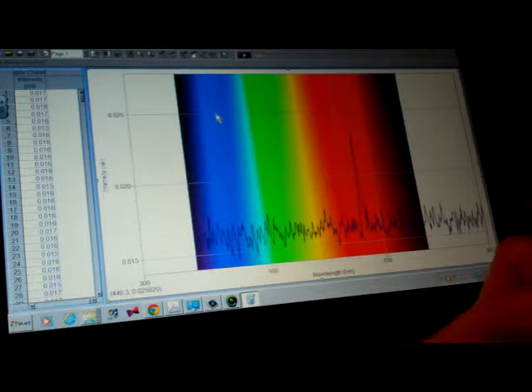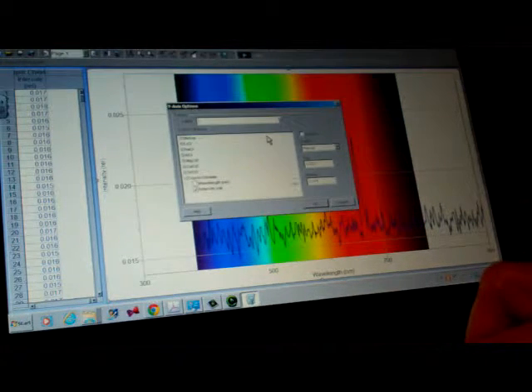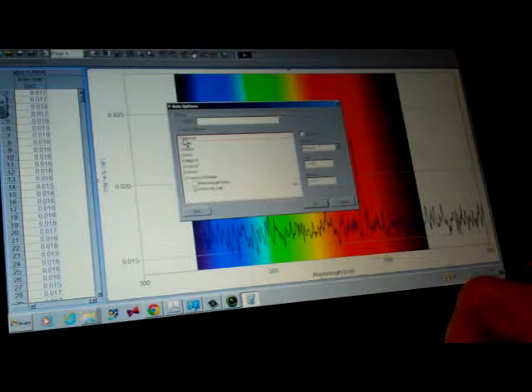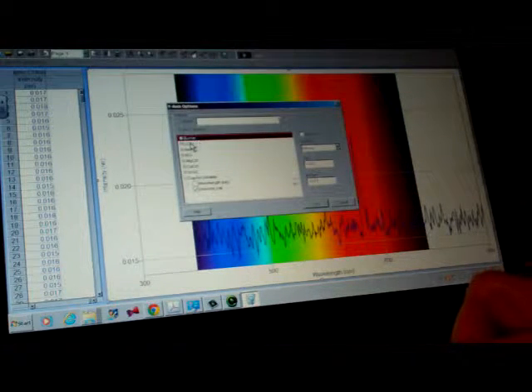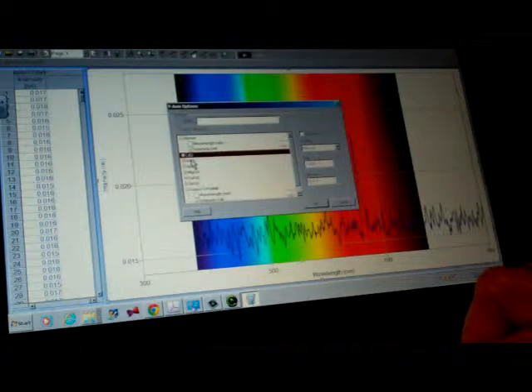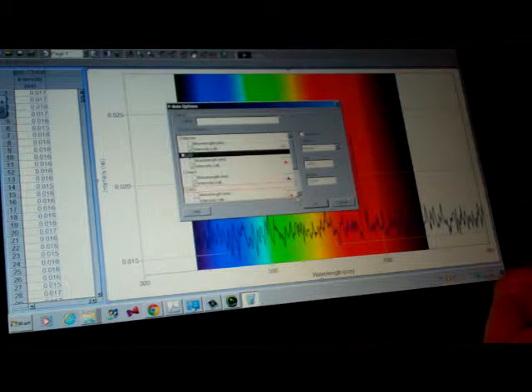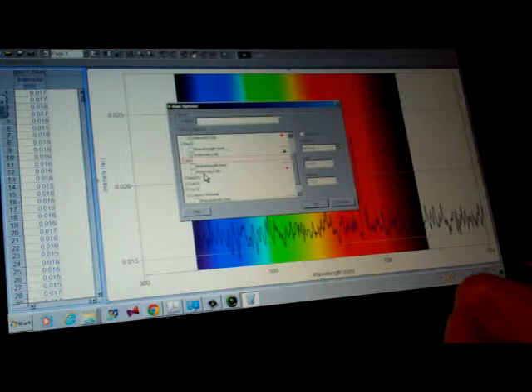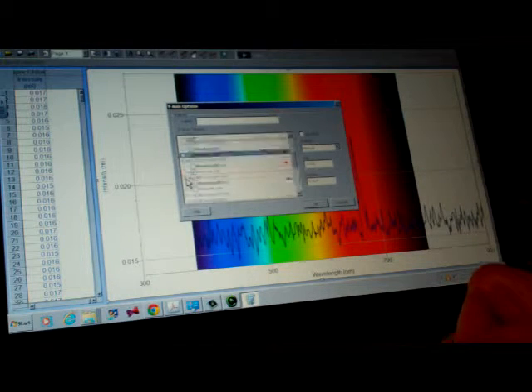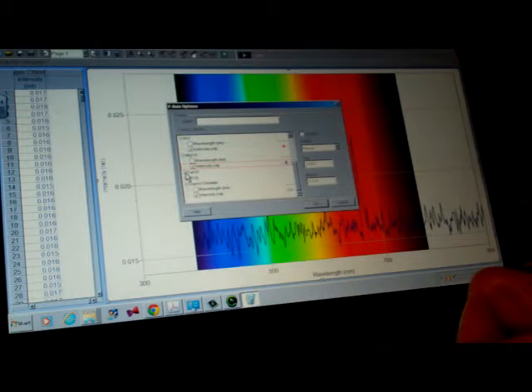Now, what do I actually want you to do to fix this graph before you turn it in or submit it? What we do want is the intensities of all of these. So you can go back and click the intensity on each of your compounds, which is actually your atoms that we're measuring here, because the chloride was just a vehicle to bring in that ion element.